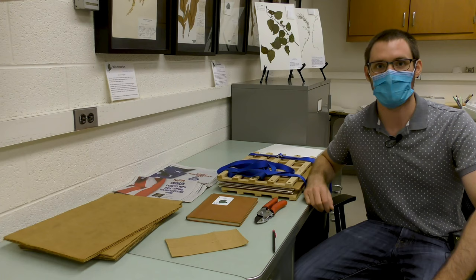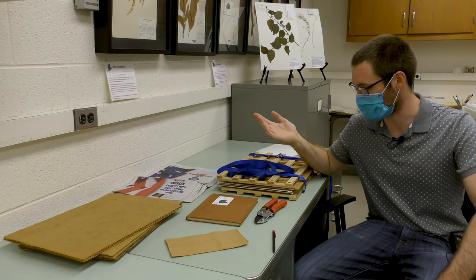Welcome back to the Michigan State University Herbarium. My name is Matt and I'm getting ready to go collect some plants tomorrow. What I've got here is some equipment that I've prepared that I'm going to tell you about.